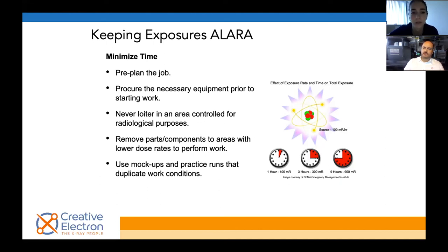Hey, Mariem, we have a question here from the audience. Is the area where the x-ray is installed a radiation controlled area? No. So we fall into this category of closed cabinet x-rays, that is not one of the requirements that's by the federal government. Some states have different requirements. It's still not considered a radiation controlled area, but some states require you to post that there is an x-ray machine.